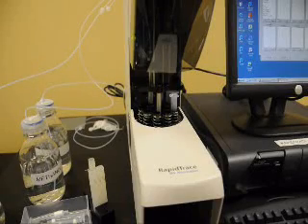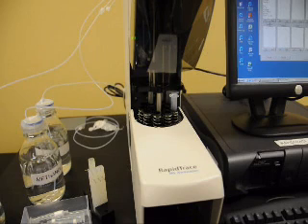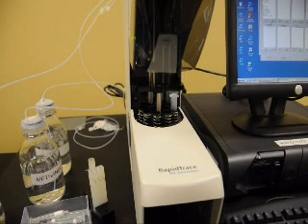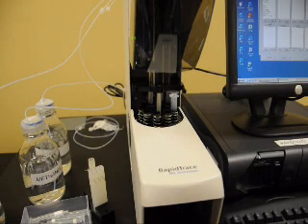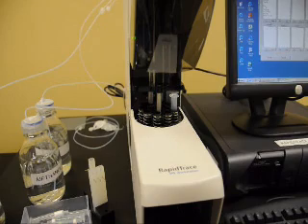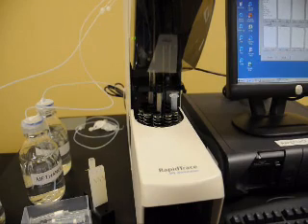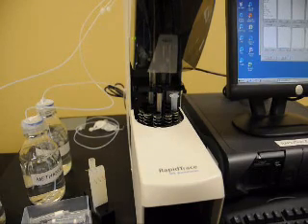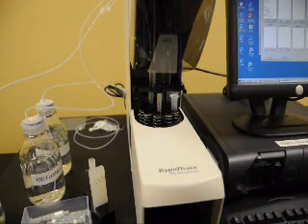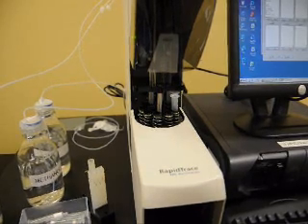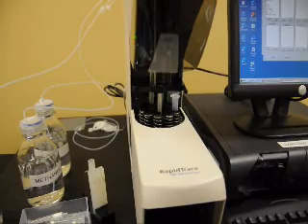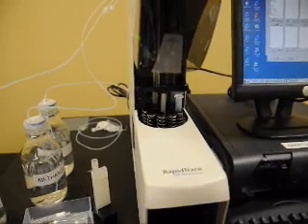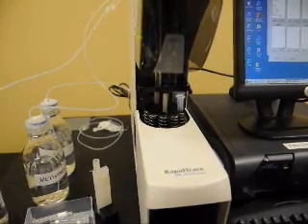The system is now continuing on with loading the sample through the SPE column. And to do this, the cannula goes down into the sample tube and aspirates the sample into the syringe. And then it passes through the SPE column. And unless we've specified we'd like to collect a fraction, it will go through to the aqueous waste portion of the waste reservoir.